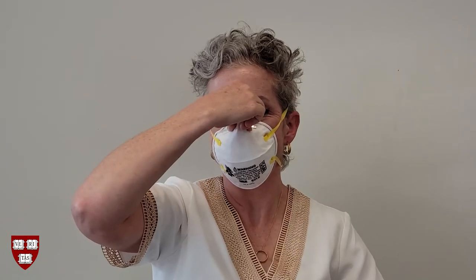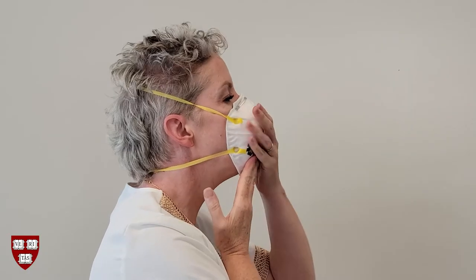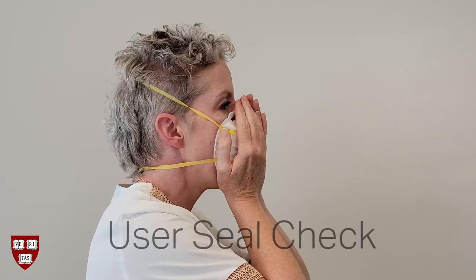Press and pinch the nose clip so it conforms to the shape of the bridge of your nose. Feel the edges of the facepiece to ensure they are in complete contact with your skin. Now it's time to perform a user seal check, which is critical to ensure the filtering facepiece is fitting you properly and adequately protecting you.